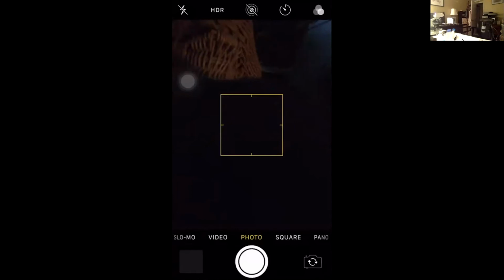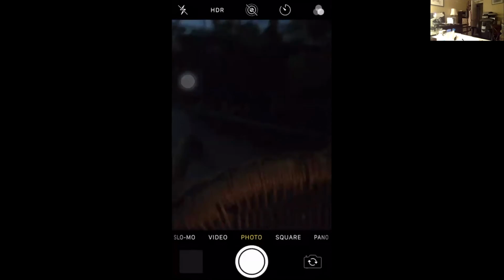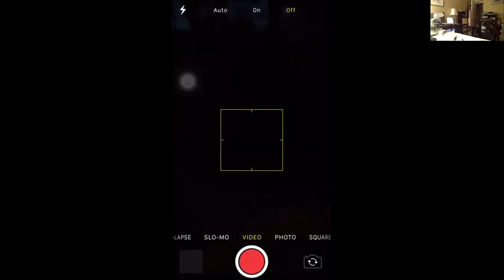And now we're going to take our plastic bag. I'm going to liberate the clod and push it through. So we've got this super high-tech soil sampling and containment device. It's pretty amazing what high technology we're working with today. All right, so turn my flashlight off.